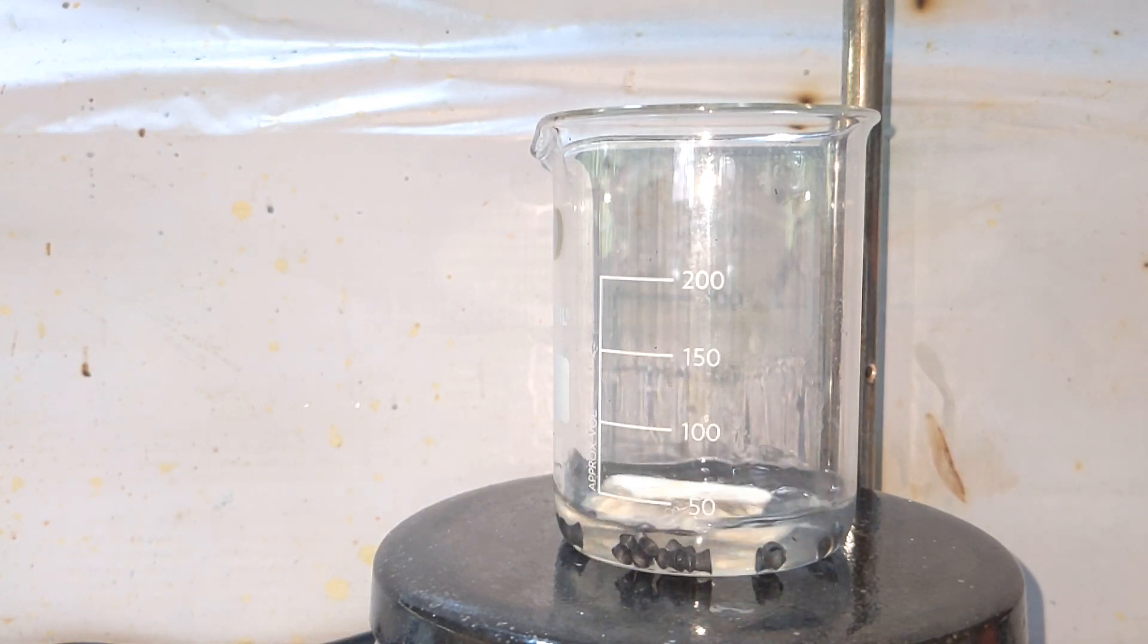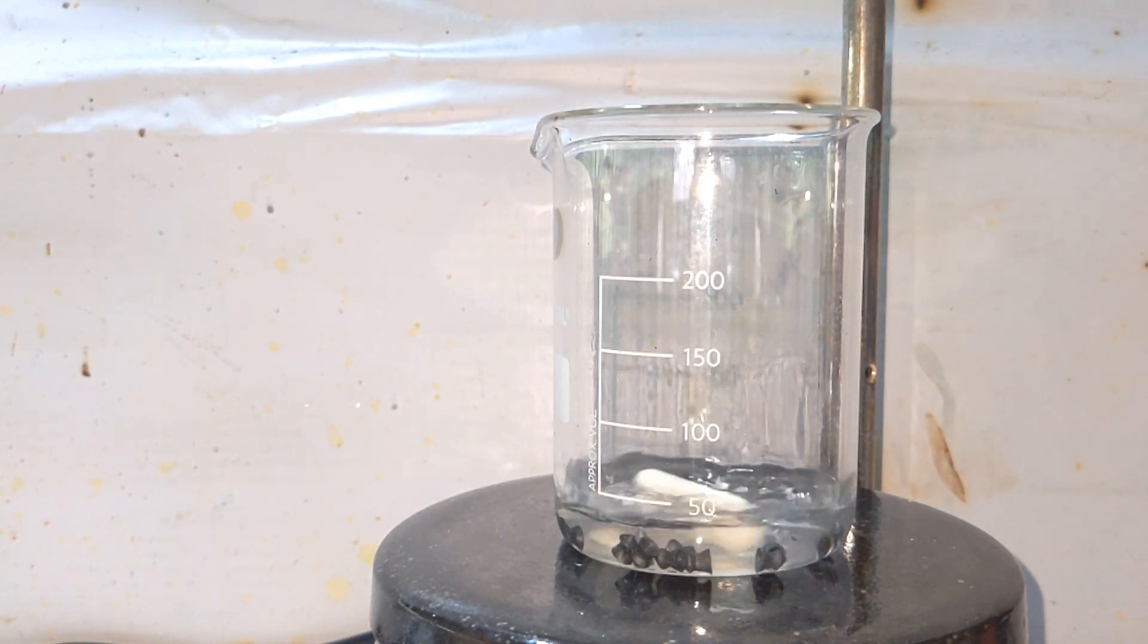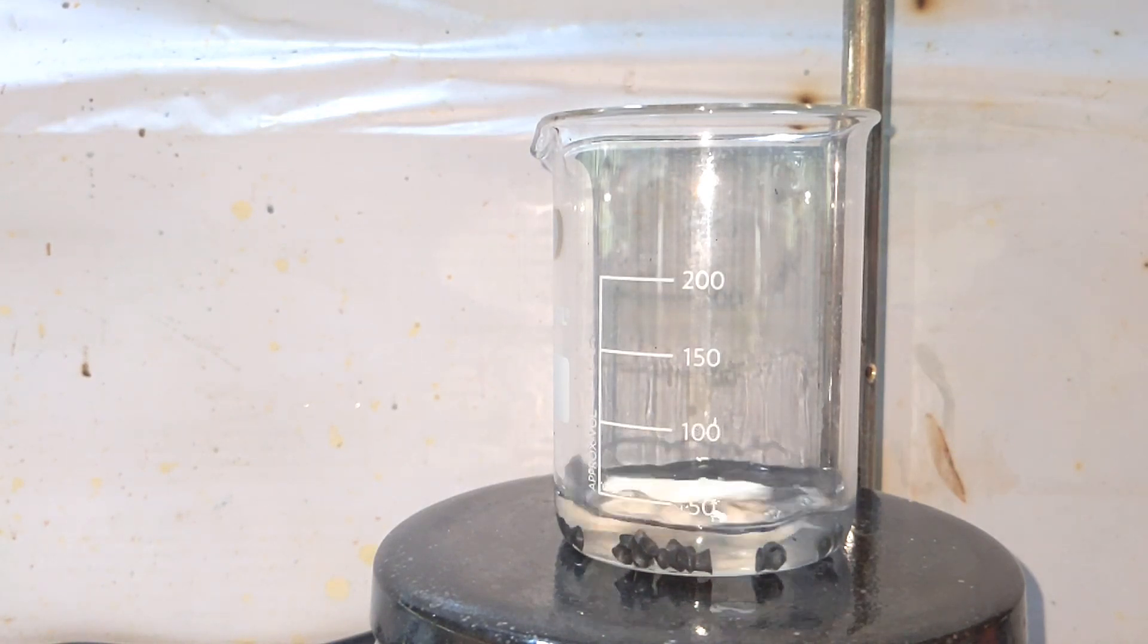On adding, you immediately see an oxide layer on the lead metal. This is actually preventing the reaction from happening.